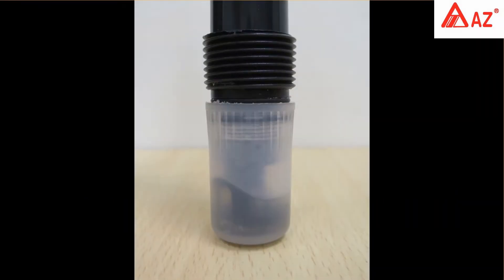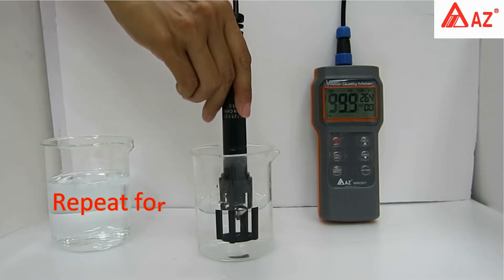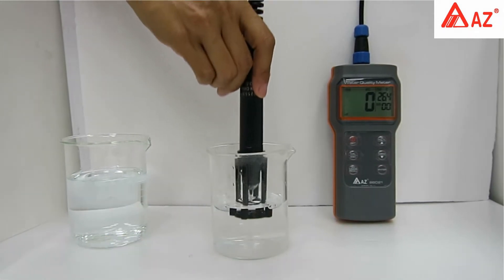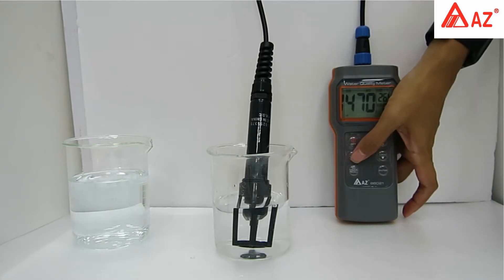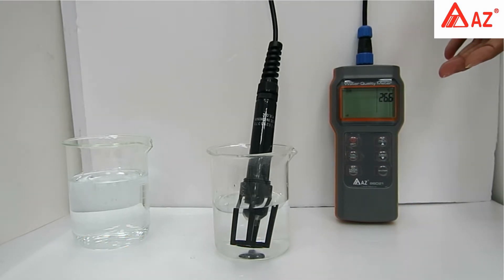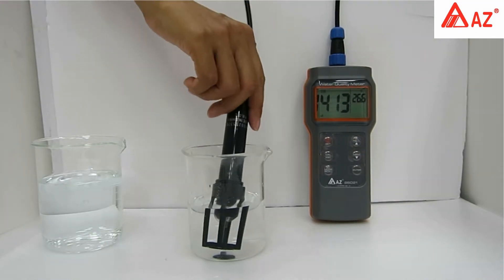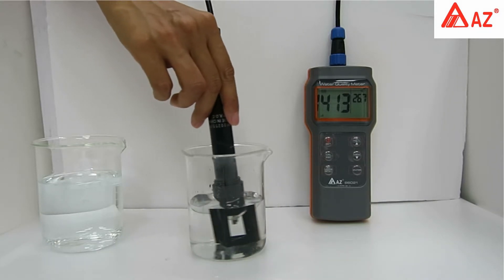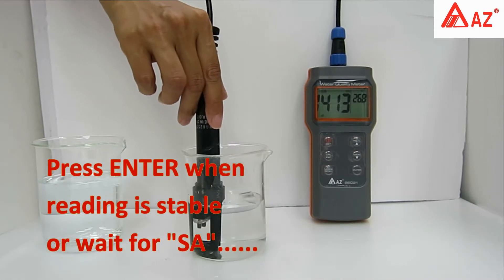Dry the glass bulb and replace the storage cap. For conductivity calibration, press EC mode to switch the unit to microsiemens. Repeat four to five times: dip in solution and swing dry to remove air bubbles, which can result in inaccurate readings. Long press Cal to enter calibration, set the standard value using the up and down keys. Only a single point calibration is needed — choose an appropriate standard according to your measuring range. Once the reading is stable, press Enter or wait for the save icon.